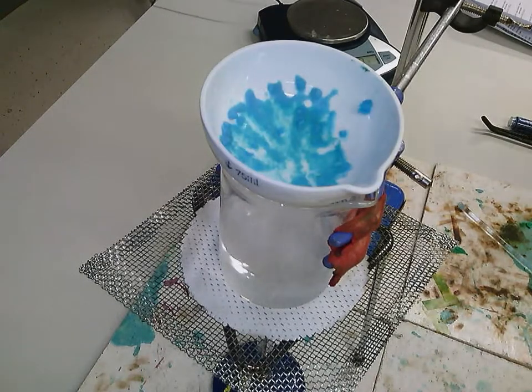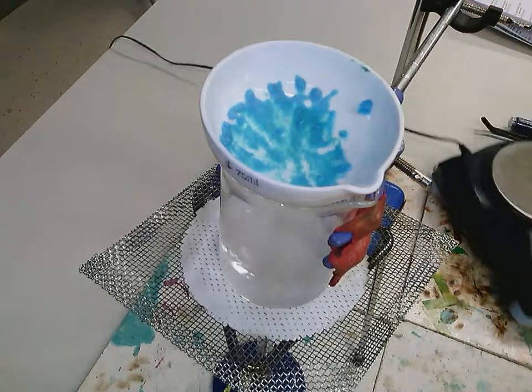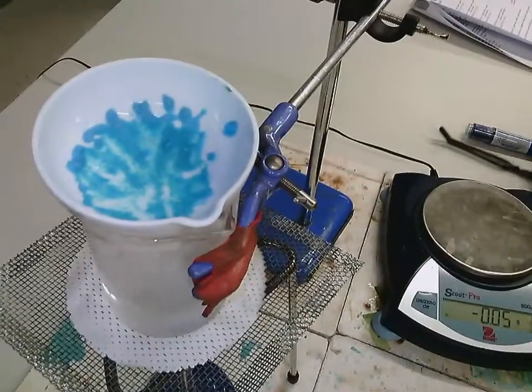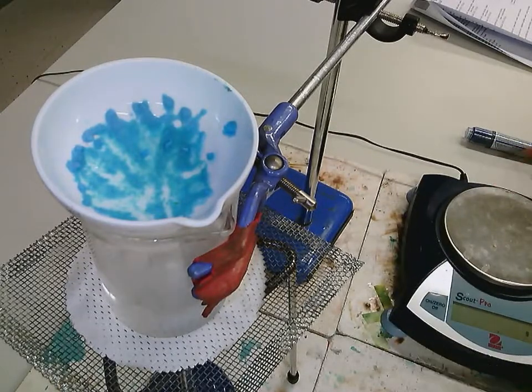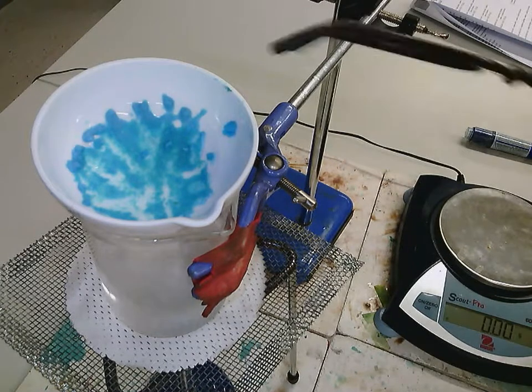Reached the point now where all the water has officially gone. So what we're going to do is start weighing. I'm going to make this 0. So using the tongs, I'm going to take it off, I'm going to weigh it.